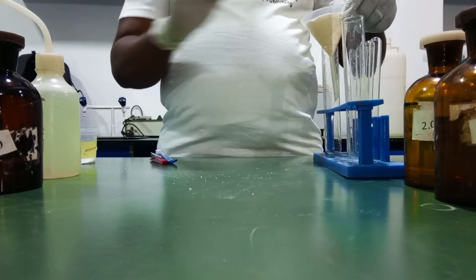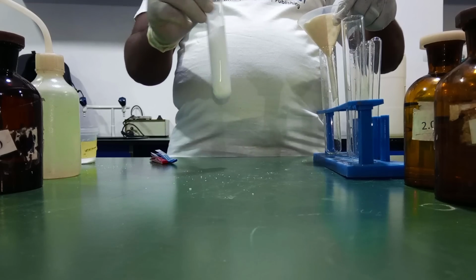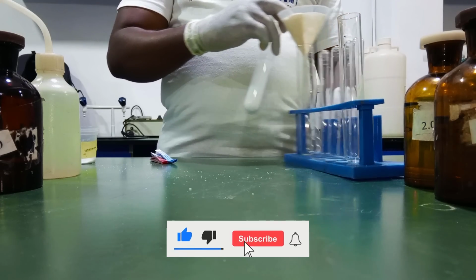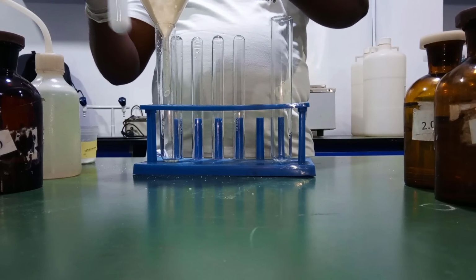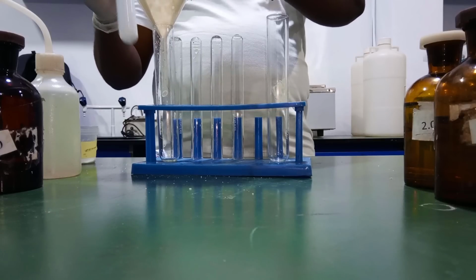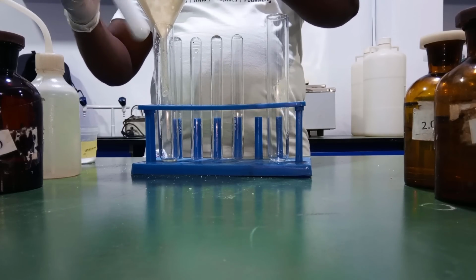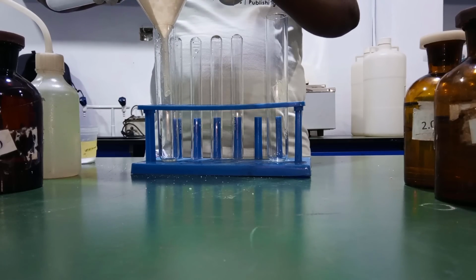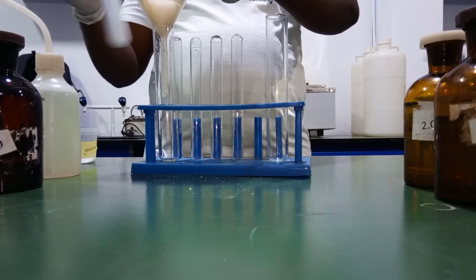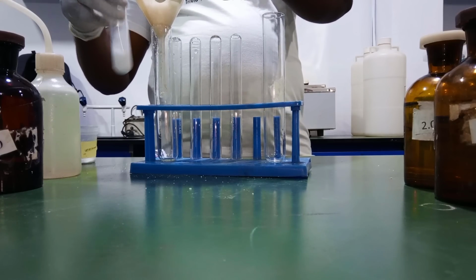So I'm going to pour this mixture into the filter paper and allow it to filter out.